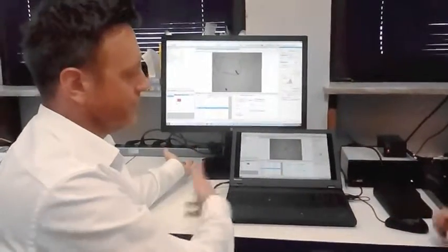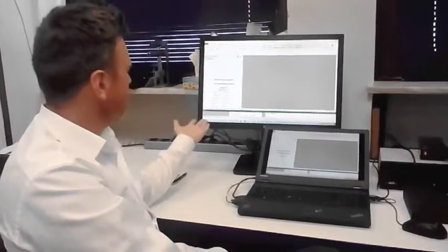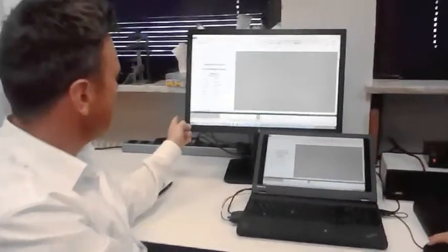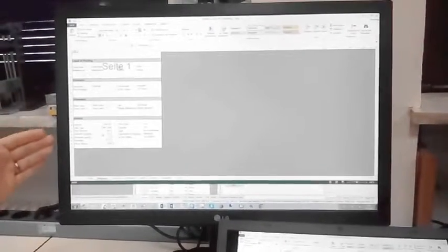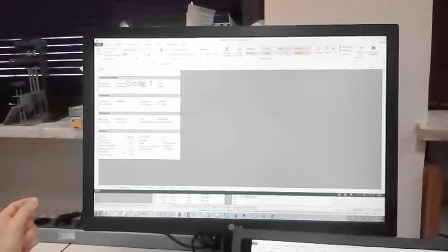Looking for the directory to save the file. So we could save that onto a network or onto the local drive or what have you. So Karen's clicked save. It's opening up Excel, and there's our report straight away, auto-generated with all of the data contained within. So it breaks it down to the different tabs here. So we have our information that we entered all about the customer details and perhaps an order number or this kind of thing. We also have, sorry Karen, is there? These would be also interesting. So we have your resolution you measured, then what threshold we are using. Yeah. And the phase fraction means the relation from particle to filter area. Right.